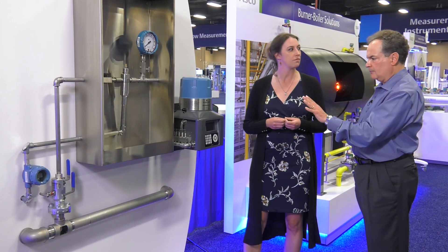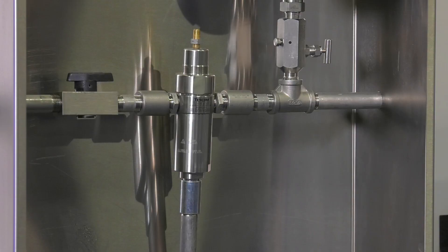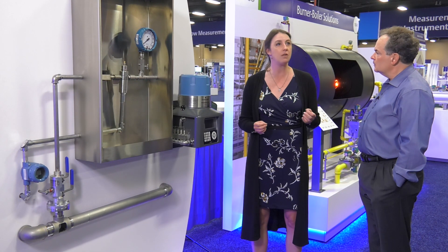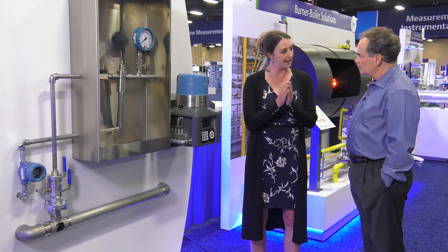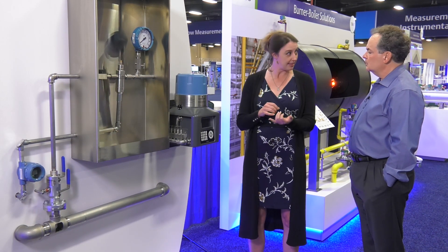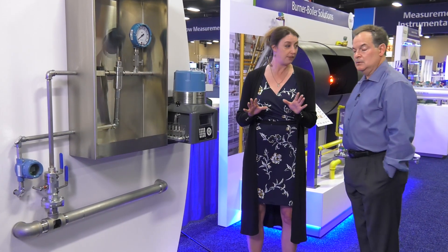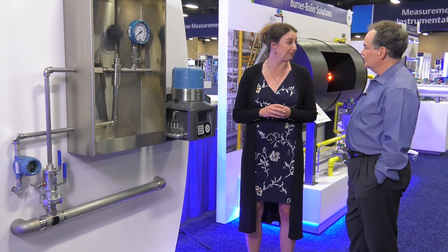So what's new about this offering? Well, what's new — and we're really excited about this — is that we're introducing the TESCOM 446800 vaporizing regulator. This is the component that delivers the heat to ensure that you have a single phase going to your gas chromatograph every time. What's new isn't the heating technology itself — we're still maximizing the surface area and contact time of that sample to ensure it has the heat it needs. But what's new is how we control temperature. Every model comes with a PID controller so that the user can set the temperature anywhere between 50 to 400 degrees Celsius to make sure that even if the process changes over time, you still have exactly the amount of heat that you need available out of that vaporizing regulator.